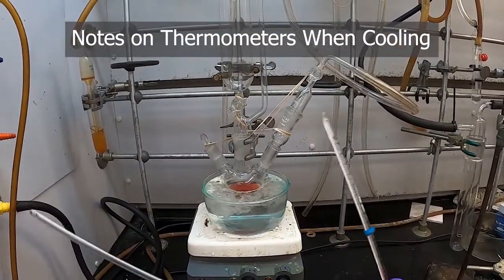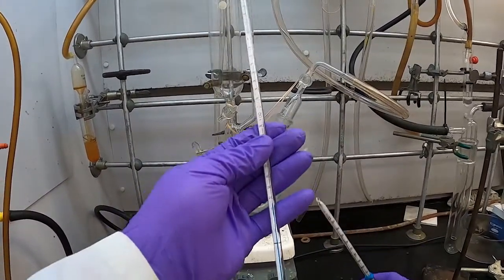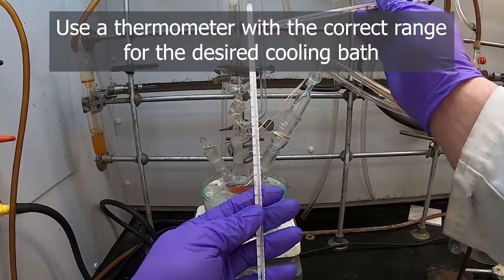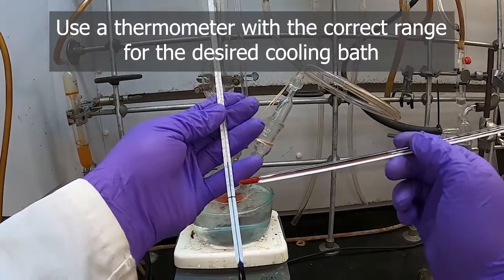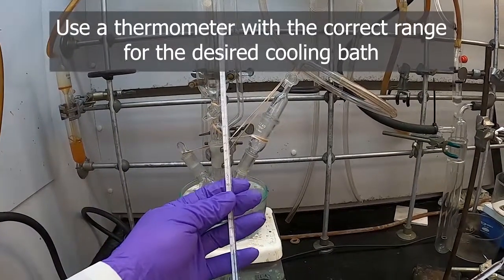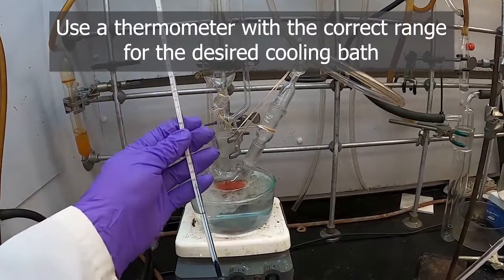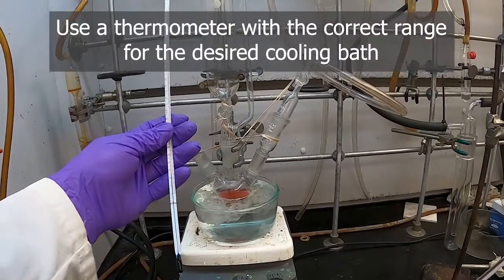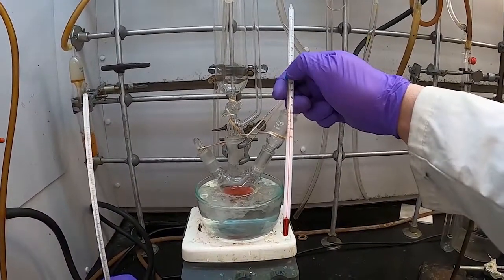It's also worth discussing thermometers, especially picking the right thermometer for your bath. This large thermometer with the blue liquid in it has a maximum measurement of 260 degrees Celsius and a minimum of minus 10. That's its range. So it has a really good range, more so on the high end. This would probably work for this bath. I don't see it getting much below minus 10, or ever below minus 10. But for polar baths, this of course would not be good. This one goes to minus 20.